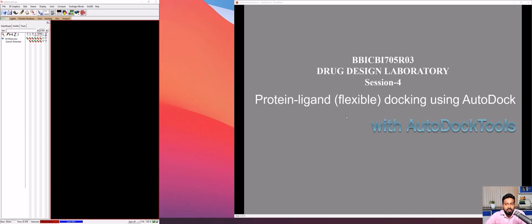Hello everyone. I'd like to welcome all of you for another video tutorial session for the drug designing laboratory. So this is session number 4, in which I am going to demonstrate how to perform protein ligand flexible docking using AutoDock with the help of AutoDock Tools.